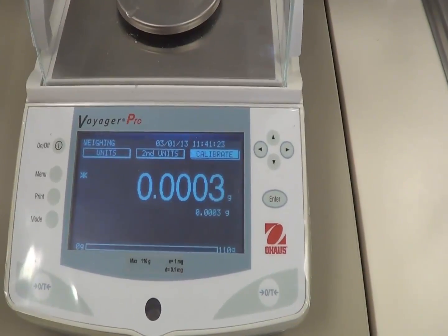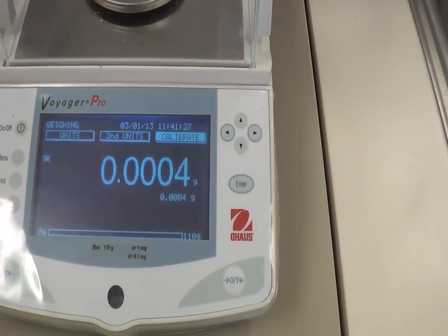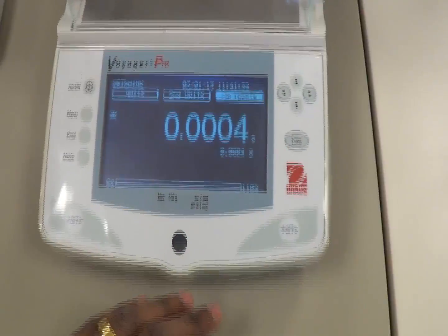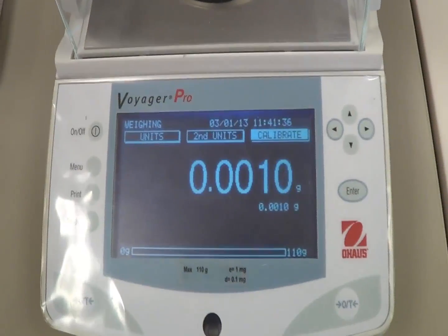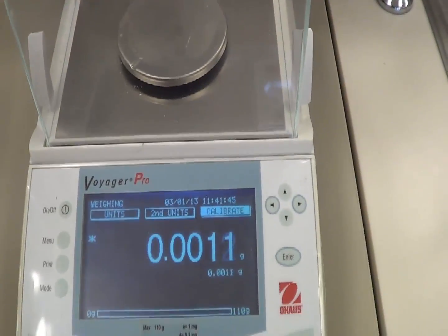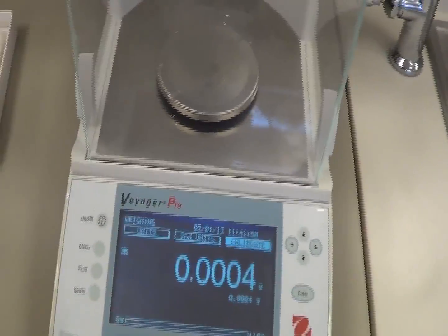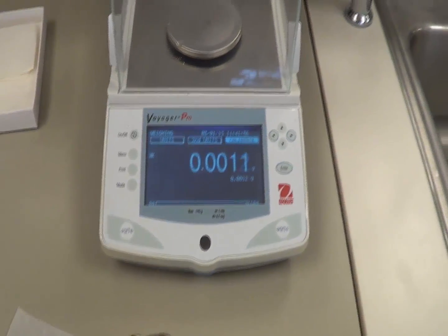So this weighing balance, can you see, there is tilting in grams. Now it is showing 0.0003 grams. If I put my hand here, can you see the difference? I can vary the grams over there. That means even though there is no weight in the weighing balance, still there is variability in the weight. So make sure when you are weighing, don't just lean on the desk, don't lean on the desk like this, so that you will be weighing the weight.